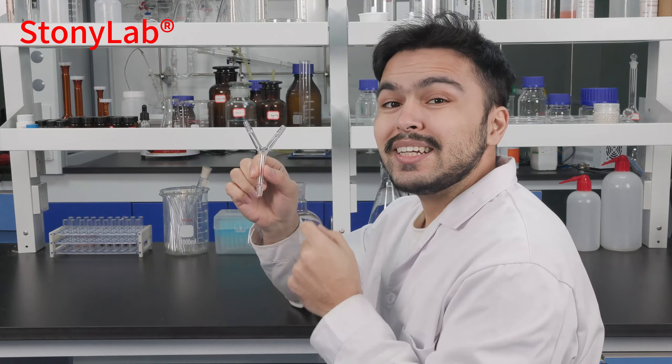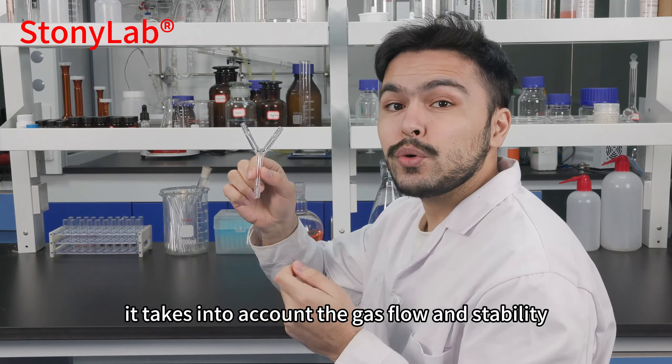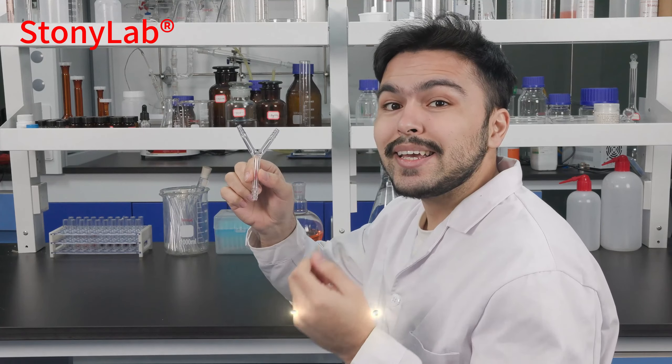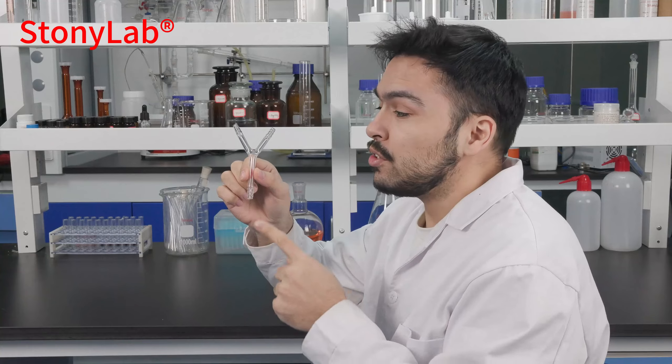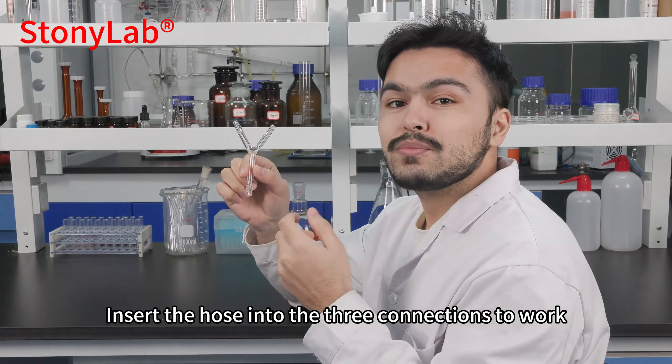The 3-hose connection spouts take into account gas flow and stability and can meet the needs of different experimental conditions. Simply insert the hose into the 3 connections to use.